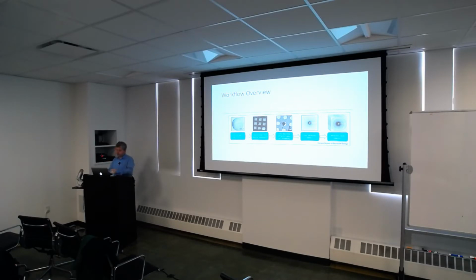Actually, one of the people who worked in Tamir's lab, Dan Shi, used to be in the same lab where I was a postdoc, and he was working on these thin 2D crystals of calcium pump that were like 2 or 3 layers thick or 4 layers thick. He had to write all this software to try to index the thing, and it was almost impossible. And the eventual solution was to make them thicker and get 3D crystals.